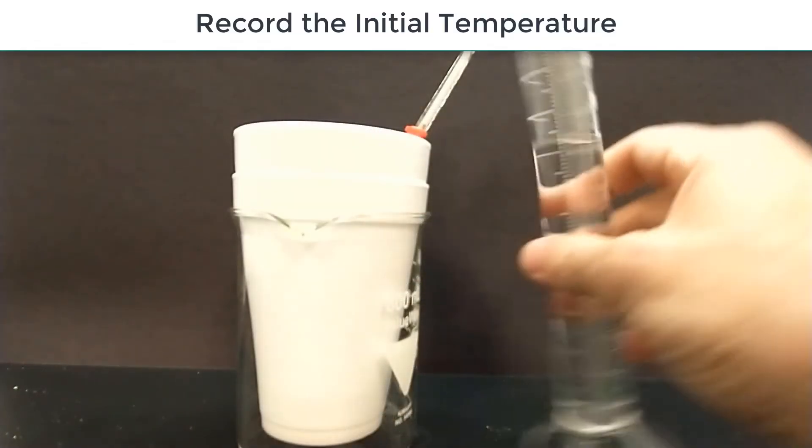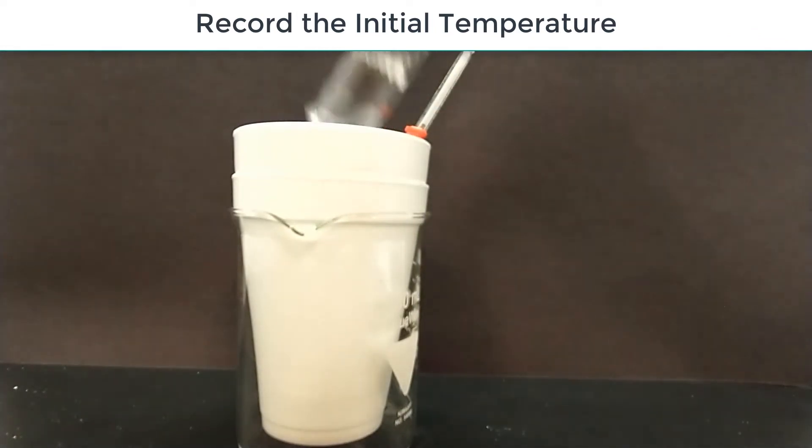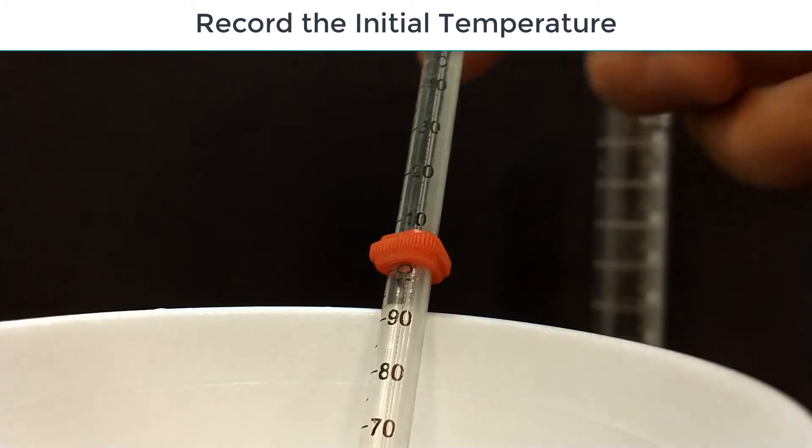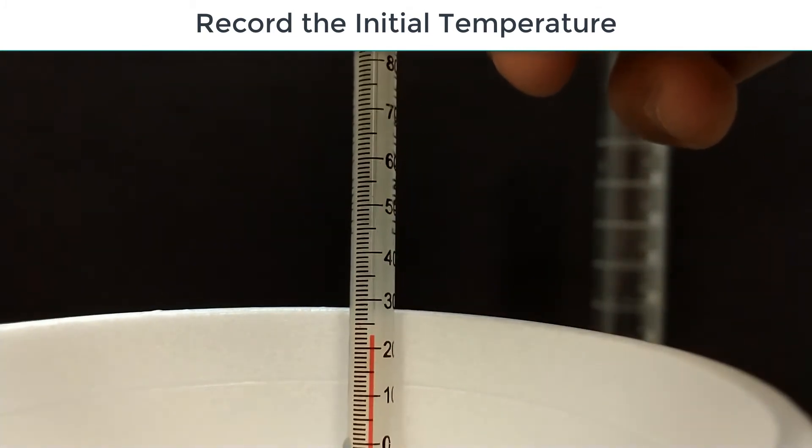The next step you're going to carry out is to pour that ammonia into your calorimeter and record its temperature. So we pour it into the insulated cups, give it a little mix, and then record its temperature.